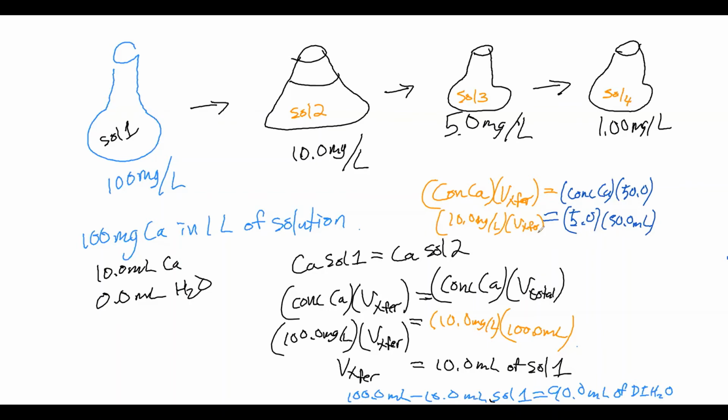And we should be able to figure out what volume we need to transfer. And so you're going to complete that for number 1, number 2, number 3, and number 4. And so this is how you complete table 1 of your chart.